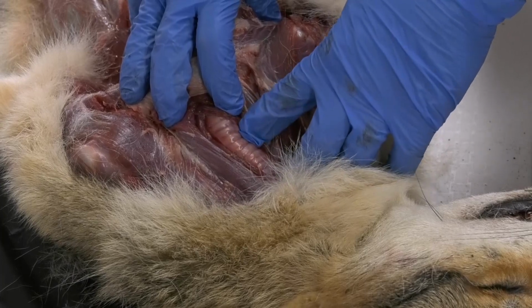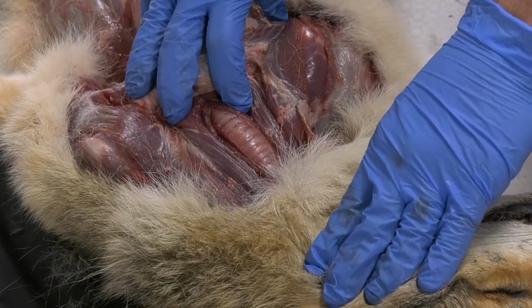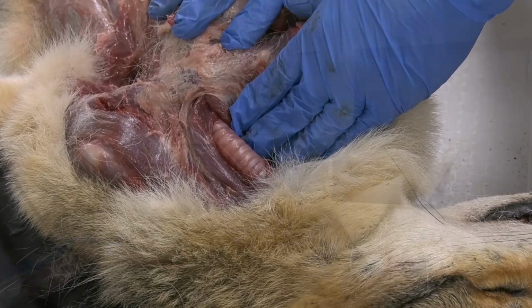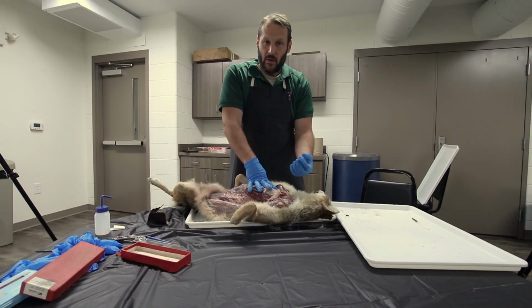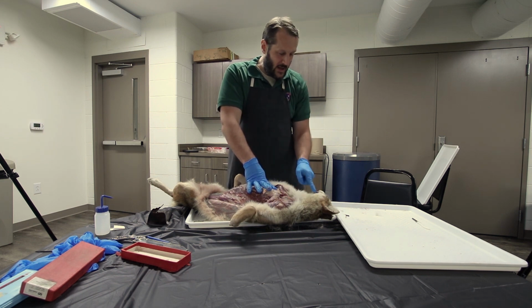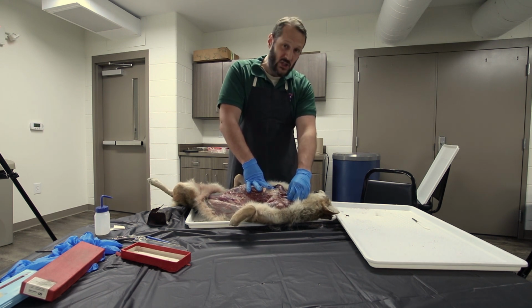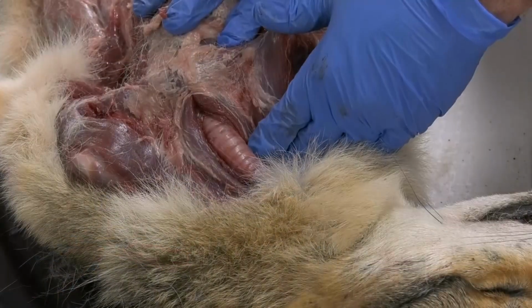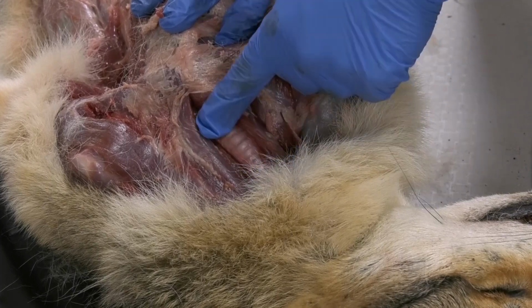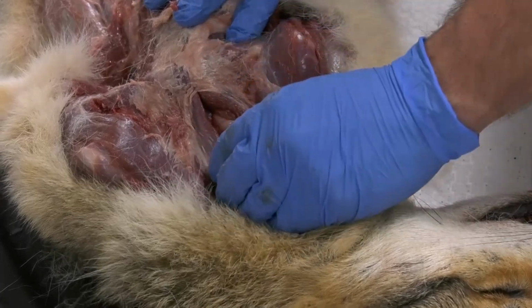This is a specialized structure for transmitting large quantities of air into the lungs, which we might see in just a moment. And the lungs, of course, are where it's going to pick back up carbon dioxide from all the cells in the body and expel that back up through the trachea and back out the mouth and the nose. So the coyote's trachea is actually shorter than the black rat snake's, but it's a similar structure. It's cartilaginous in nature, and it's made up of these cartilaginous rings that offer support throughout.